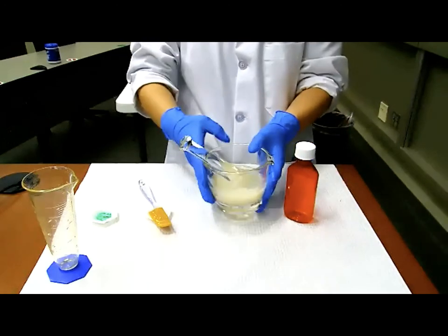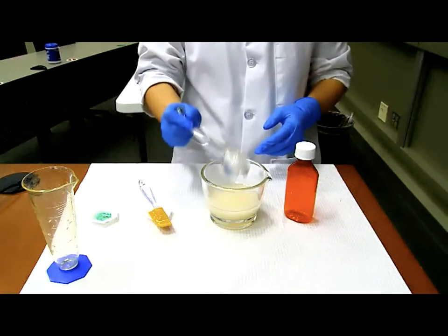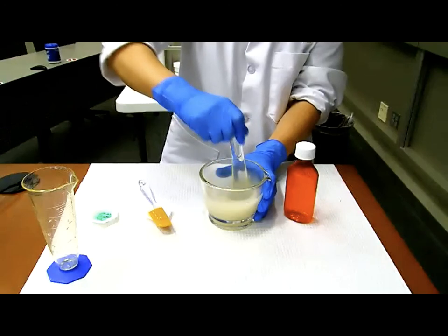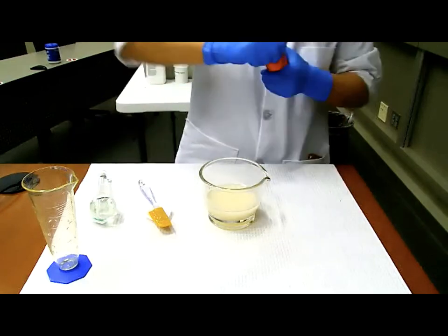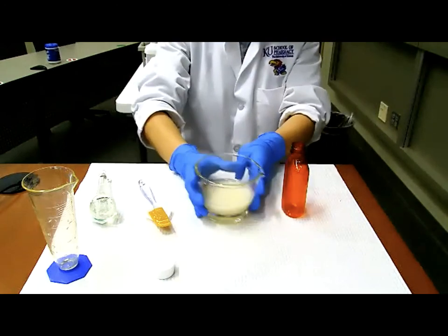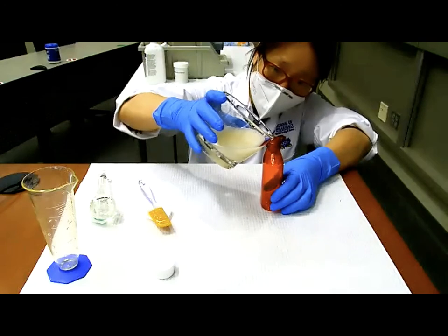However, if you have a teeny hand like I do, then you definitely want to remove the pestle. But before I remove it, I want to mix one more time, okay? And I do not want it inside because I'm afraid of breaking it. If your hands are big enough, then you don't have to do this, but only if your hands are too small. So now we are ready to do the transfer.